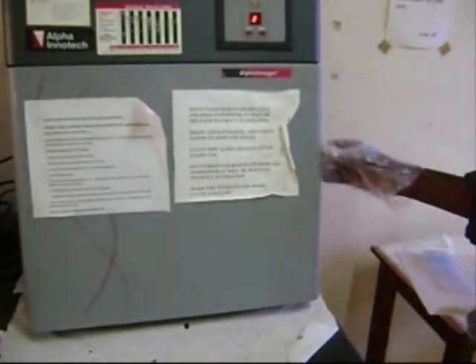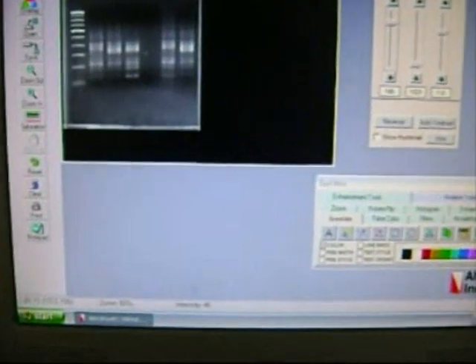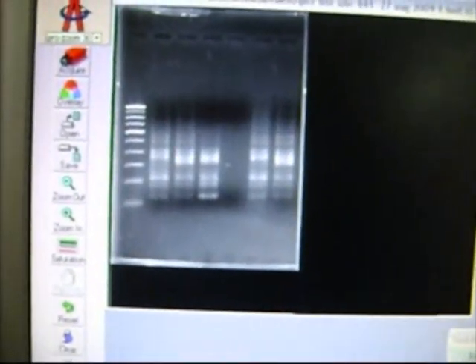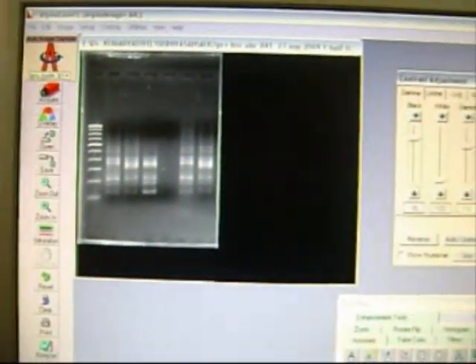The gel is now placed in the alpha imager and visualized under UV trans-illumination. The bands are then interpreted and identified for polymorphism and identification. Different bands are formed in the same genome due to different numbers of repeats and different loci of the same genome, thus enabling us to find polymorphism using ISSR markers.